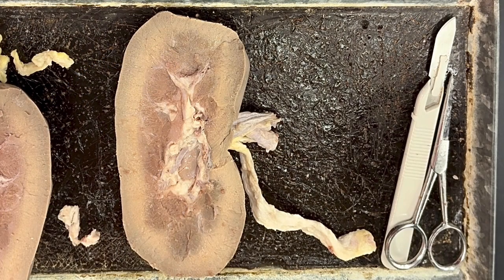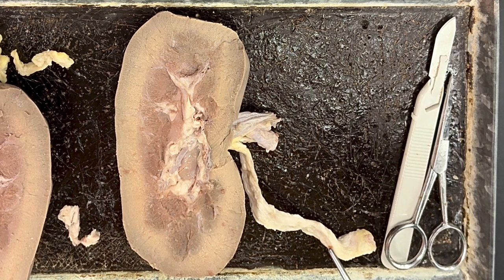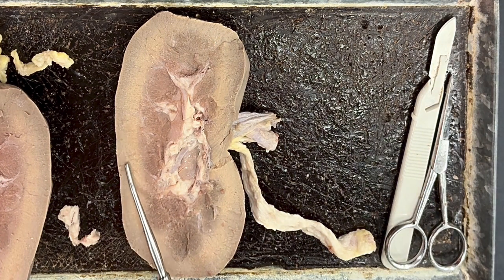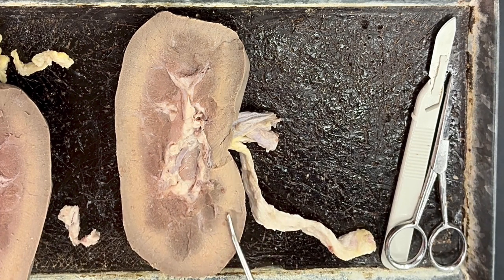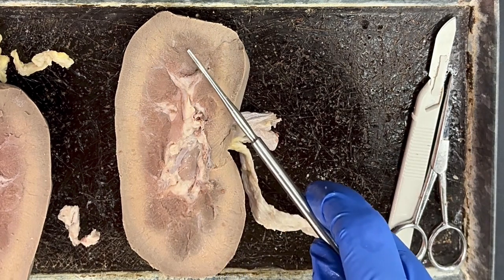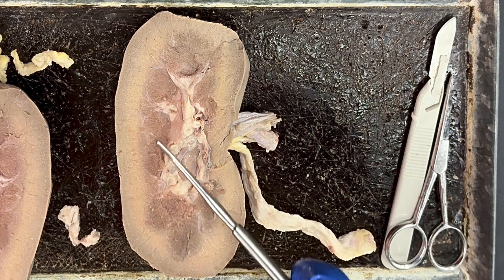Now that we've made that frontal or coronal cut, we can see that the inside of the kidney has this outer cortex. So that's what we can see as this outer layer here. And then next we have the inner medulla.